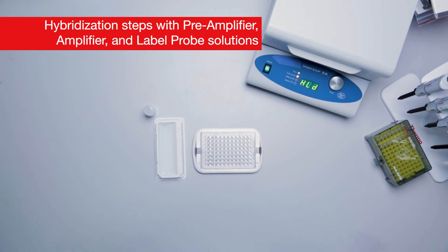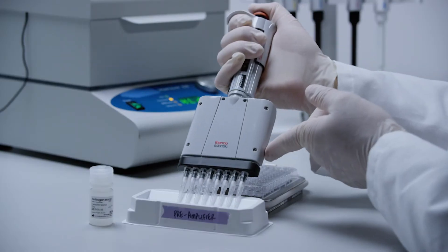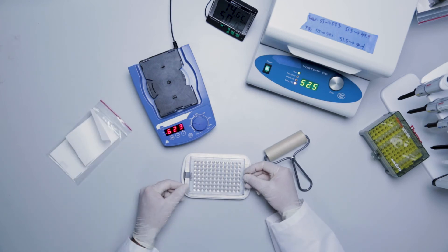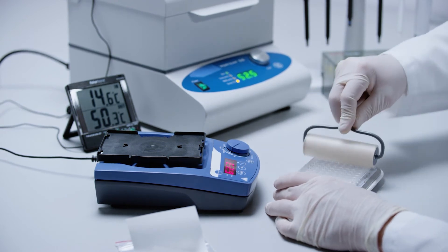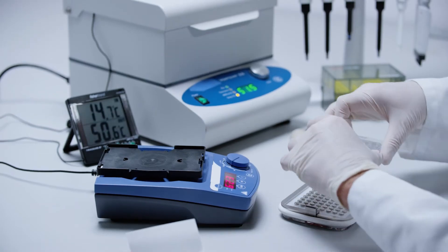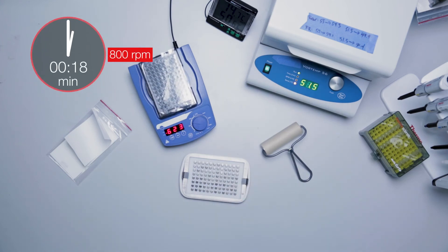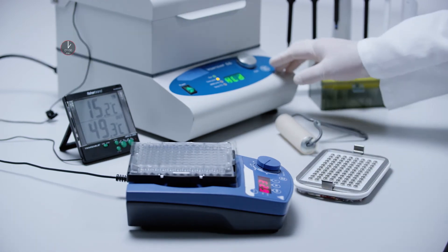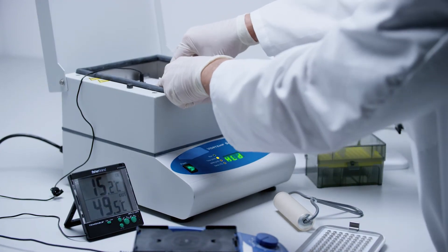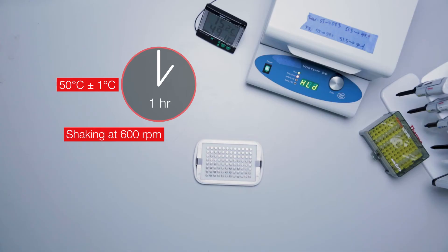Transfer the pre-amplifier solution to a 25 milliliter reagent reservoir and pipette 100 microliters into each well using a multi-channel pipette. Remove the magnetic separation plate from the handheld magnetic plate washer. Shake at 800 rpm for one minute at room temperature to re-suspend the beads. Place the magnetic separation plate into the shaking incubator. Make sure to have an inverted plate lid in place. Incubate for one hour at 50 degrees Celsius plus or minus 1 degree Celsius with shaking at 600 rpm; use 300 rpm with the Max-Q.